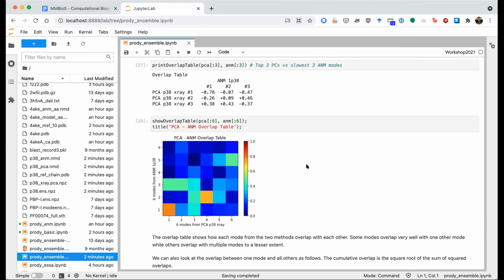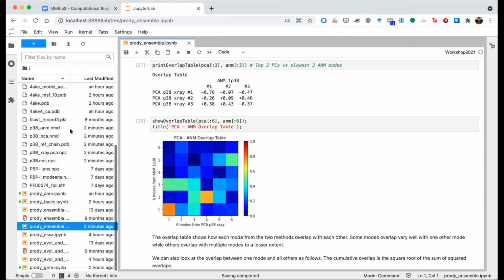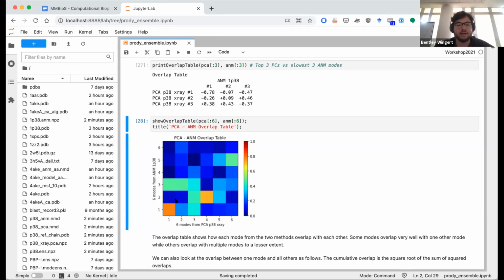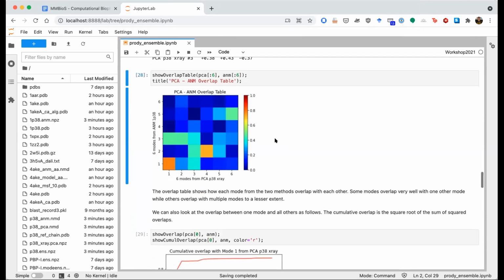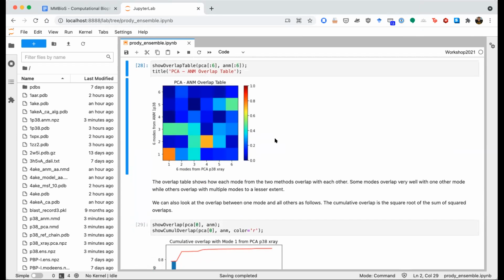Sorry, I'm trying to understand what that means. If you had something that was completely diagonal, it would be saying that both bases are essentially equivalent. And if you have something that's non-diagonal, that means the bases aren't equivalent. You mean in this plot? If the highlights are showing up off the diagonal, is that what you're talking about? Yeah, exactly. If your high values were not on the diagonal, is that just saying that what one basis called vector 1, the other one called vector 3, and there's no real significance? Or is there some significance to the two not being perfectly overlapped?